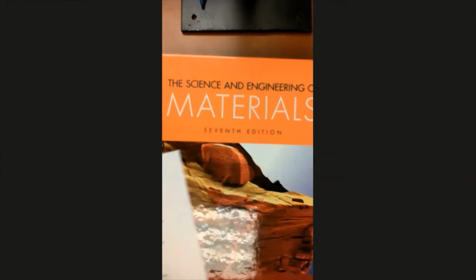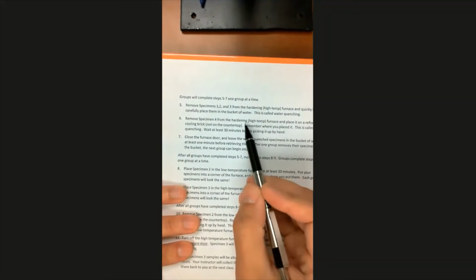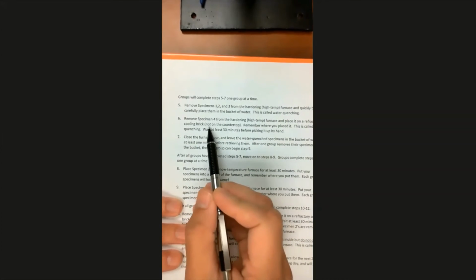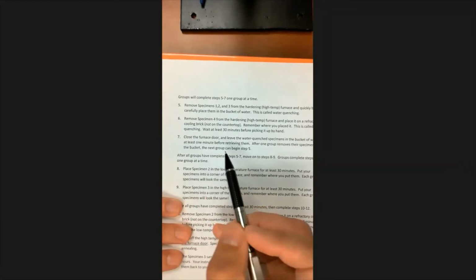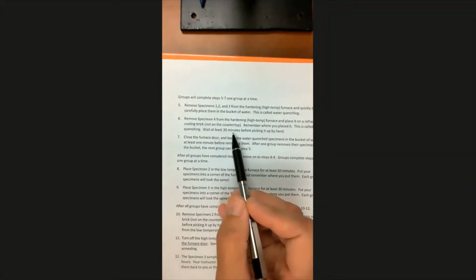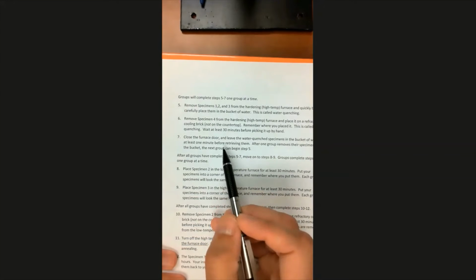Specimen 4, remember, is going to be hardened, but then air quenched. So we're not going to dunk it in the water. We're just going to take it out of the high temperature furnace and then put it on the cooling brick. We don't want to put it on the countertop because it will melt that Formica mounted countertop. This is air quenching, and it's going to take a little while to cool down. I'm just going to set it there and leave it there until the next class period when you all come in to do the second part of Lab 7.